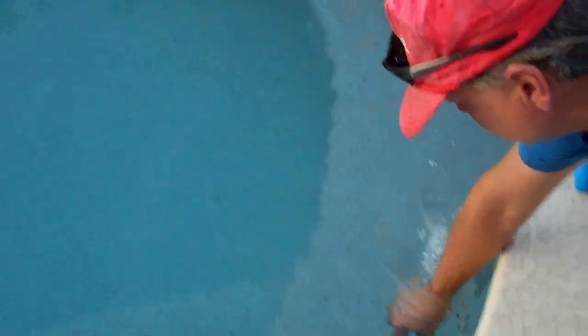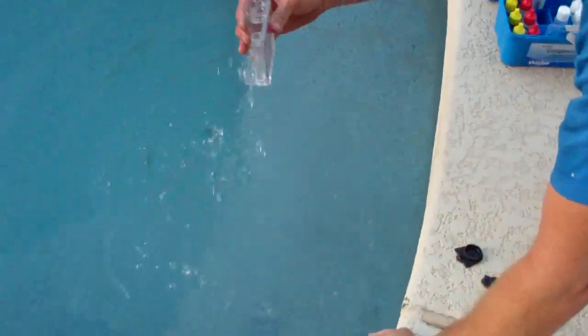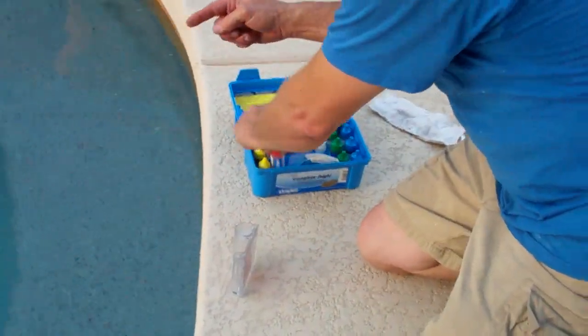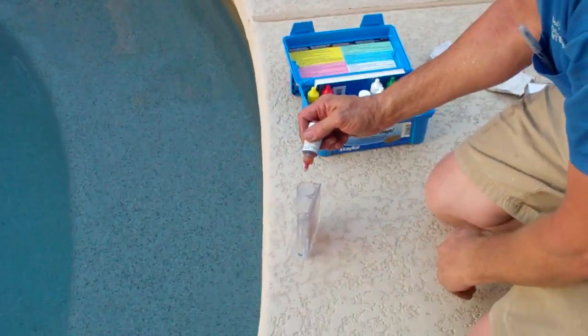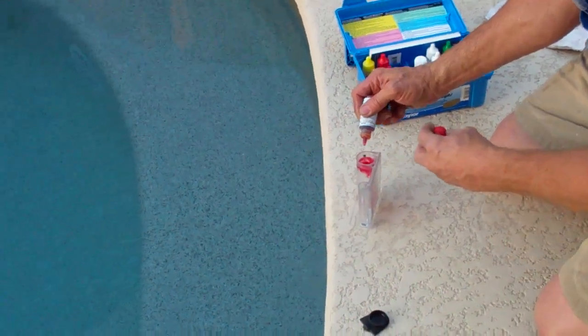So I'm going to check your pH here just to see where we're at. Go down 18 inches to your elbow and get a good sample of water right there. And then five of these — one, two, three, four, five.